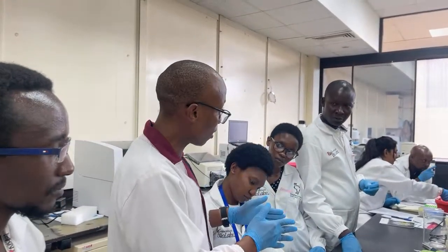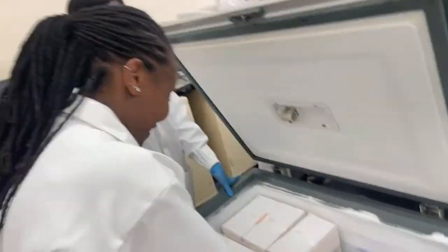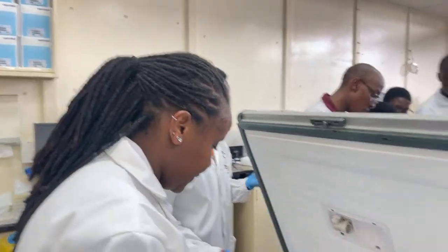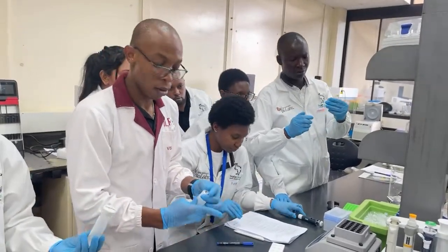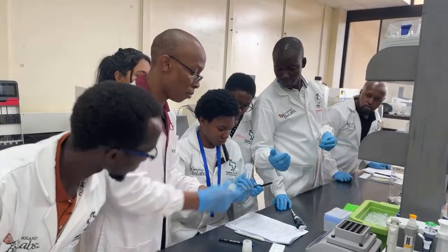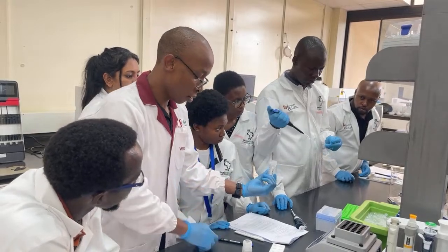So I'm going to give these guys a disc. They add it, and then they add isopropanol, and then you move to the next person. I think we have isopropanol in here. Then you invert to mix 10 times. To the next person.